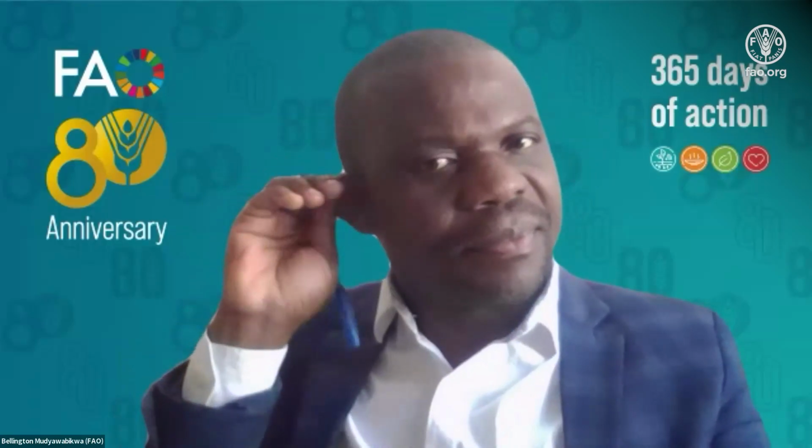Okay. The other question was about robustness, if I'm not mistaken. Yes, robustness and sensitivity. So ideally what we want is to know, like I explained, that your analyte or your instrument and your method are sensitive enough, for the lack of a better word, to still find that analyte when there are interferences. Robustness, we are often changing the external environment, whereas interferences more than likely are interferences in your matrix. You can report the two of them together in certain instances. But there are instances in some very complex methods where you would have to determine them separately.